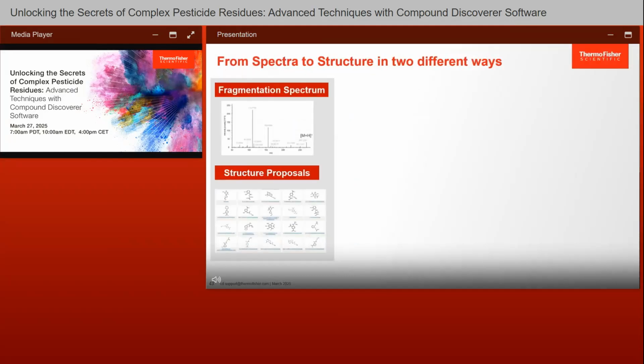To explain the next new feature, which is related to FISh scoring and mzLogic, I'd like to back up a little bit and explain how these tools are used. So even with comprehensive spectral libraries like mzCloud or the NIST MS/MS library, unfortunately we still often end up in a situation where we don't get any hits from the spectral library, but instead we have to rely on hits that we're getting from a structural database like ChemSpider, shown here.